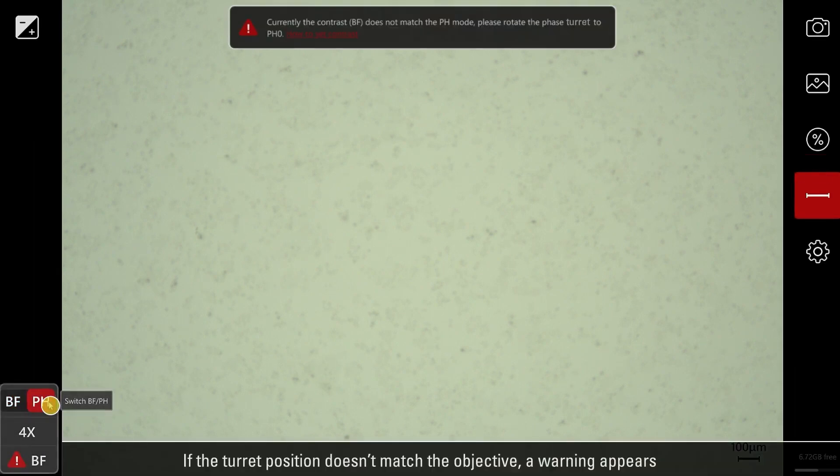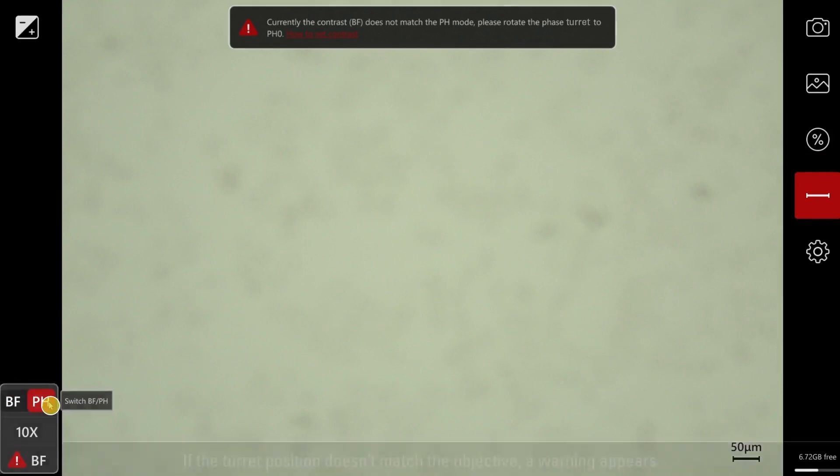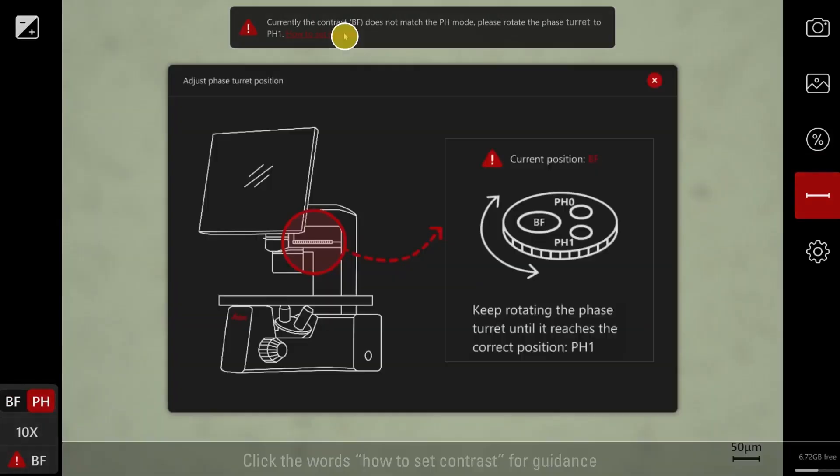If the turret position doesn't match the objective, a warning appears. Click the words 'How to set contrast' for guidance.